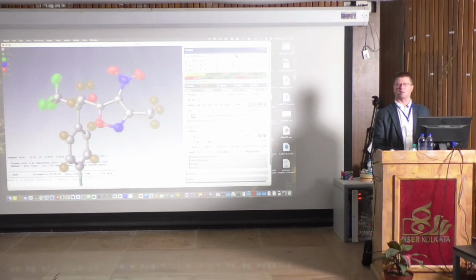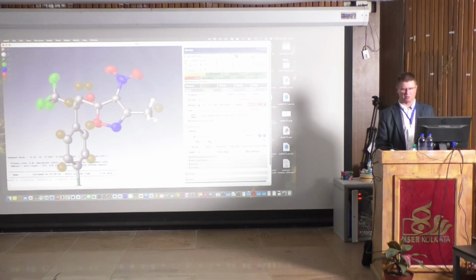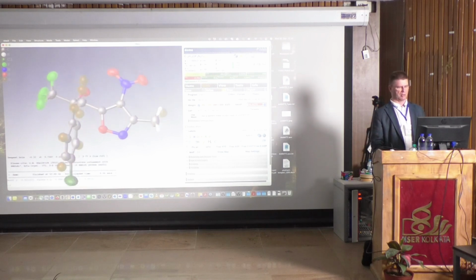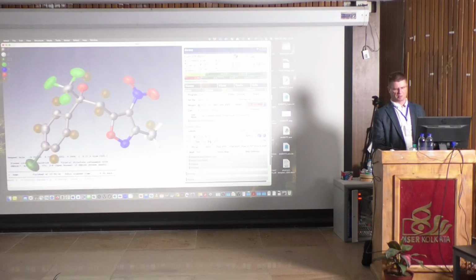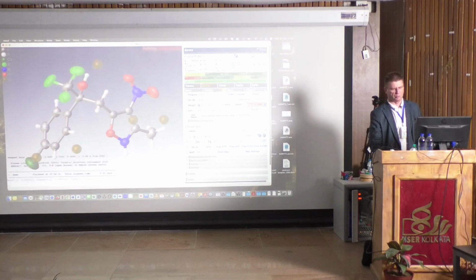And I can even do it so that I can activate this atom now and then say add hydrogen. So it will now add hydrogen on the activated atom, and then I will say refine. And you can see it disappear. And this one here, which appears, is a ghost. So it's background, it's nothing. Now, okay, I would be happy to have all the hydrogens replaced in there. I click add hydrogens, and then I will refine. Now we're there, look. As long as this goes green, we are happy, so we repeat it.